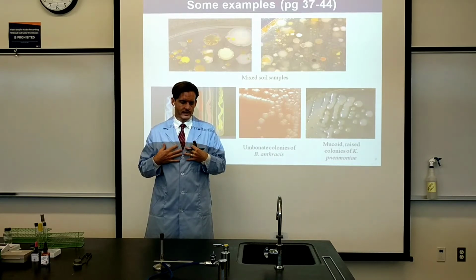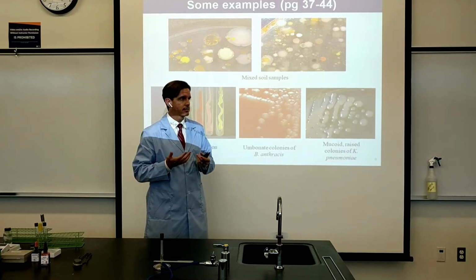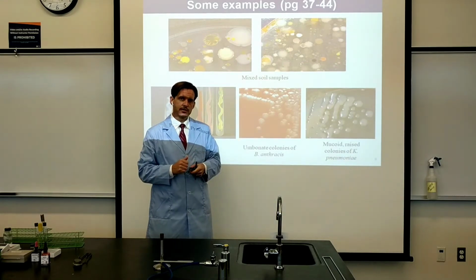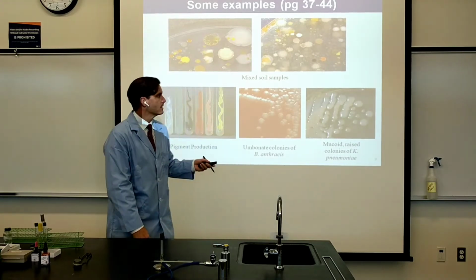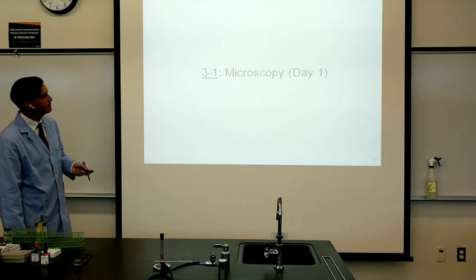Your immune cells called alveolar macrophages, phagocytes as we'll learn, will try to ingest and digest these bacteria, and they have a tough time with these sticky mucoid colonies when they're in the lungs. All right, let's move forward.